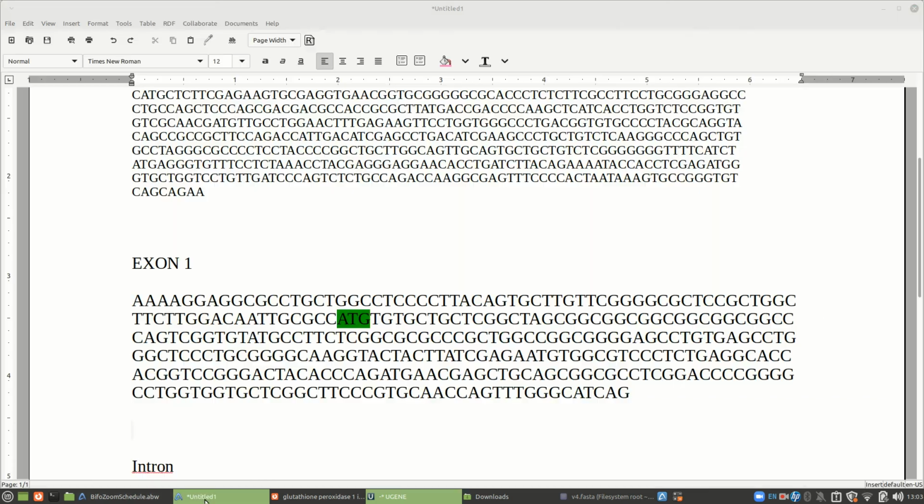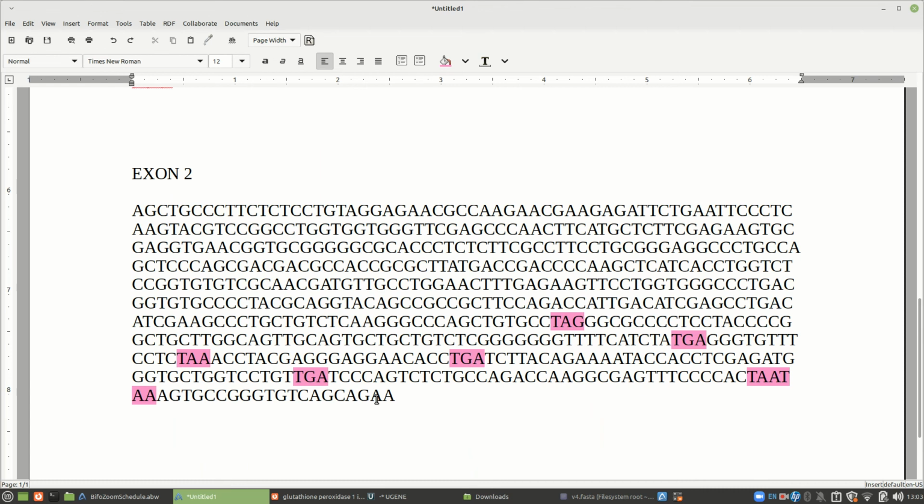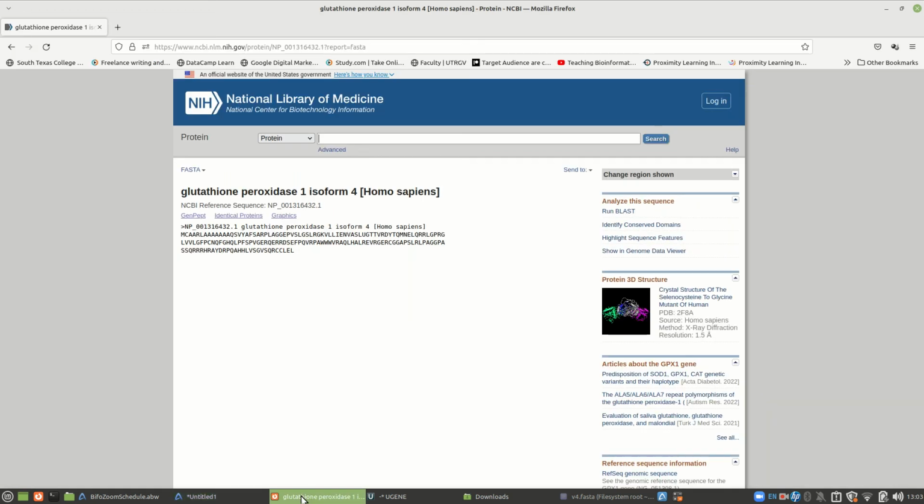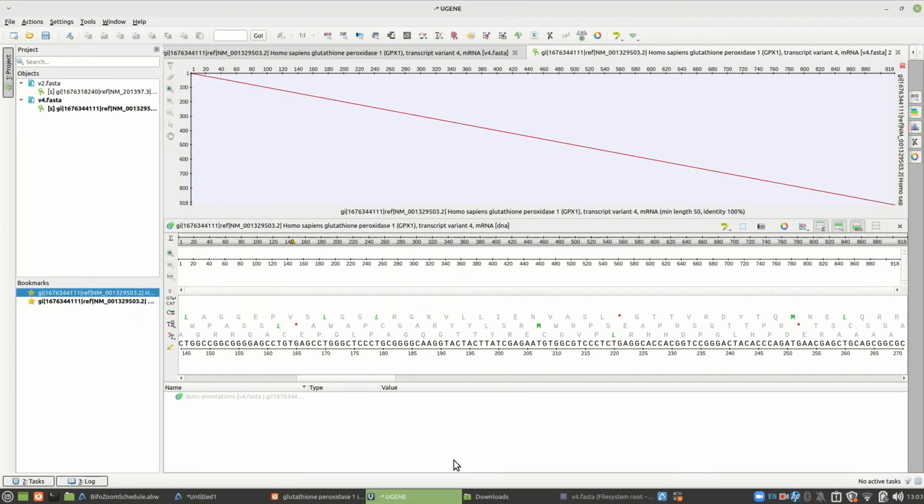And this whole idea of me choosing the ones down here was wrong. I said, hey, I thought these were good candidates, but they're not. There's one up here that is a, what was it, a TGA? All right, let me go back. Where was it, Eugene? TGA. So let's see if we can find that one. TGA, let's see what's on either side of it. TGA with a C and a G on either side.